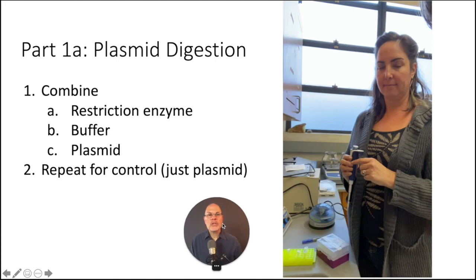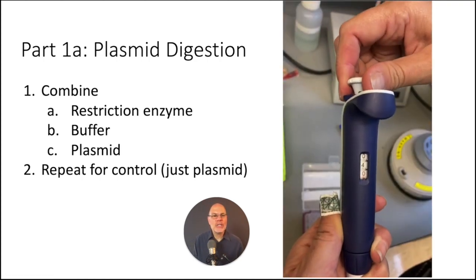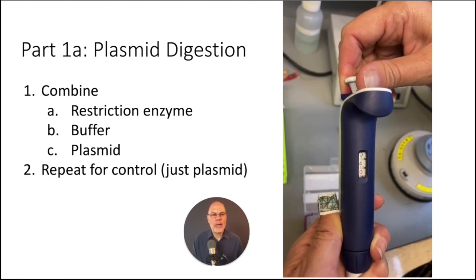Okay, so now what we're going to do is watch my colleague Johanna Berg go ahead and do a plasmid digestion. Let's see this in action. I'll talk you through the steps. So here's Johanna saying hello. She's adjusting the volume on the micropipette.